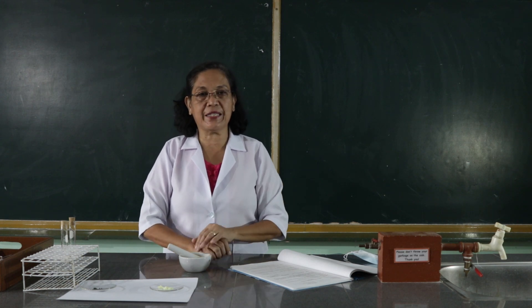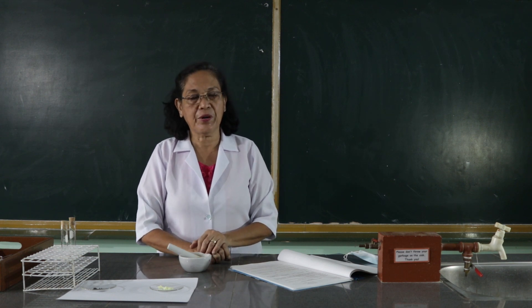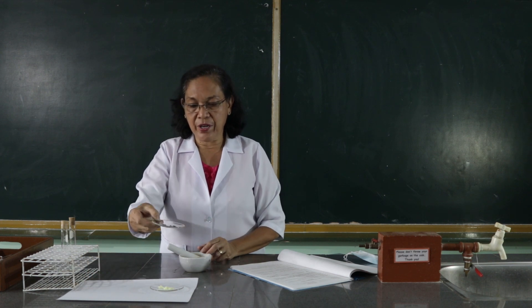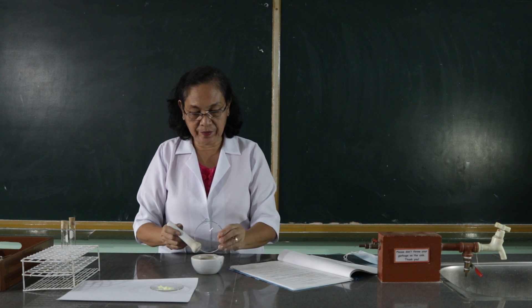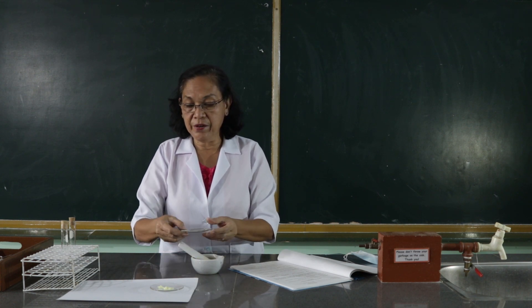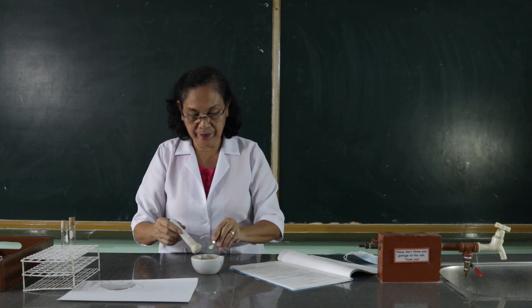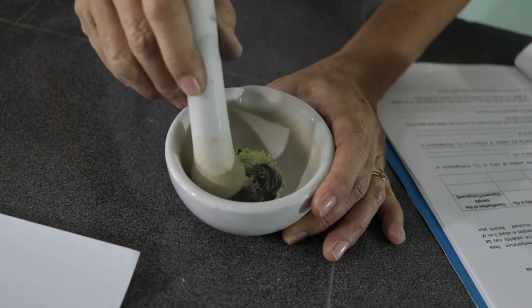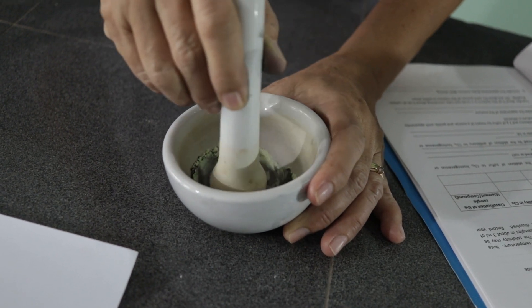The next procedure is, you are going to mix 1.5 grams of antimony with 2 grams of sulfur. So, with this antimony that we have, we're going to place this into the mortar and pestle. And we're going to mix this with the sulfur.